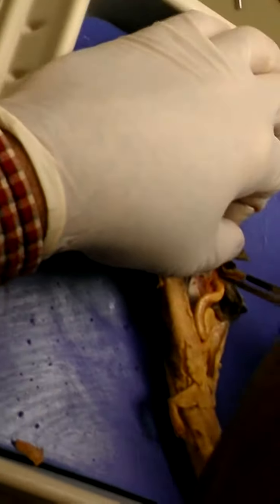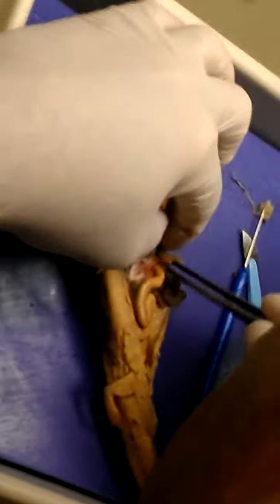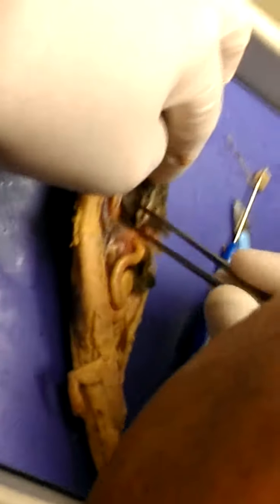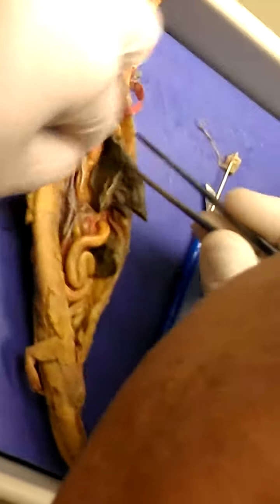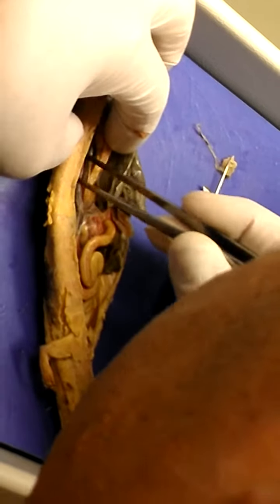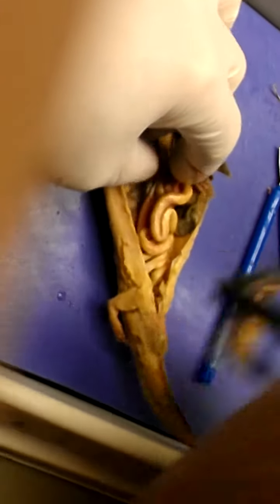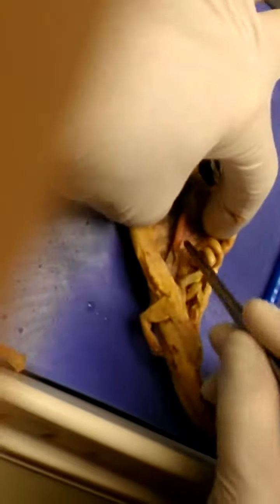This is it. That's what I wanted. Much nicer. Here's the gallbladder. Okay. So this little sac right here is the gallbladder, sitting inside the liver itself. Okay. If I pull everything back, I see I've got the dorsal aorta again. Okay. If I pull everything to the side, I have a kidney.